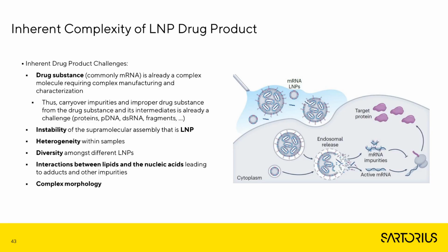And first of all, it is an inherently very complex product. So we take our drug substance, our mRNA, or our DNA, or our other type of nucleic acid, and we need to encapsulate it into a sort of vehicle. And in recent years, the most common one has been a vehicle called LNP, lipid nanoparticle, on which I am going to focus today.